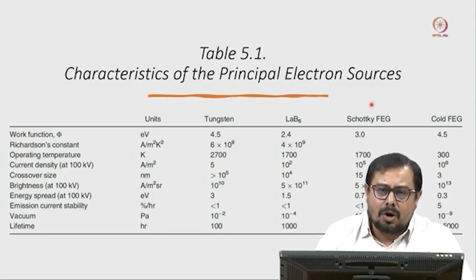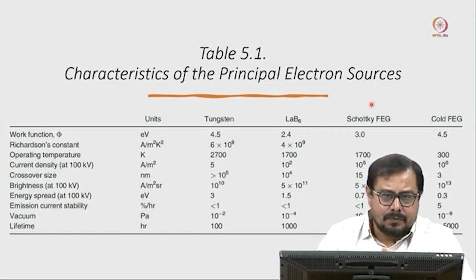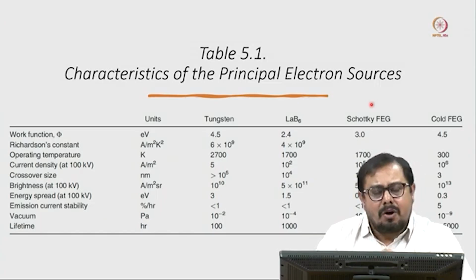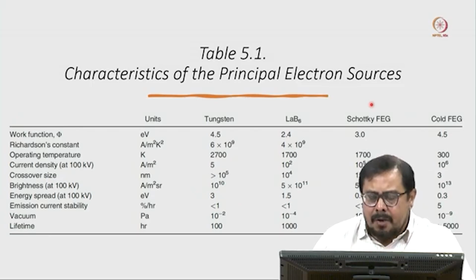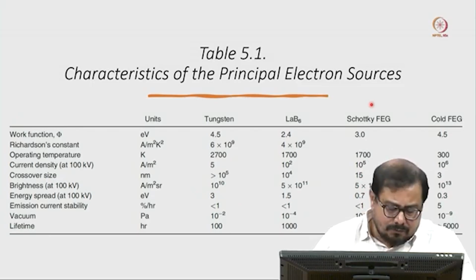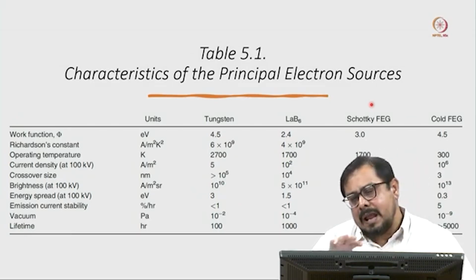Why is it so important? Because in cryo-electron microscopy we are not using any kind of staining solution. The sample will be only in your buffer, and the contrast will come from the difference between the density of your biological sample and your buffer.